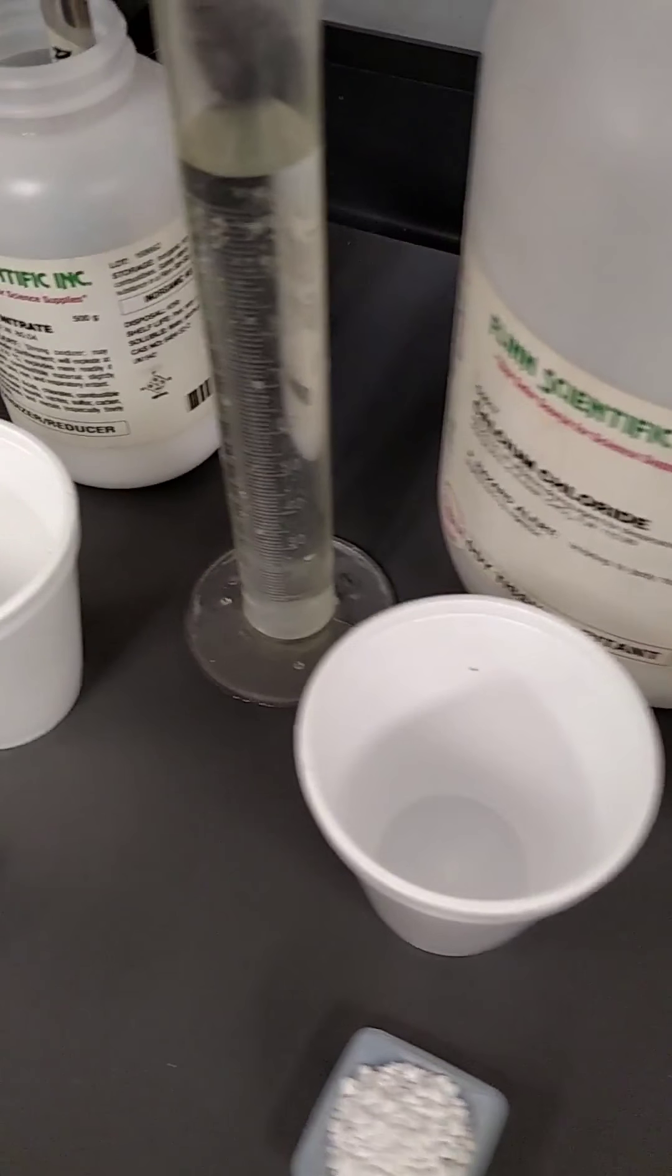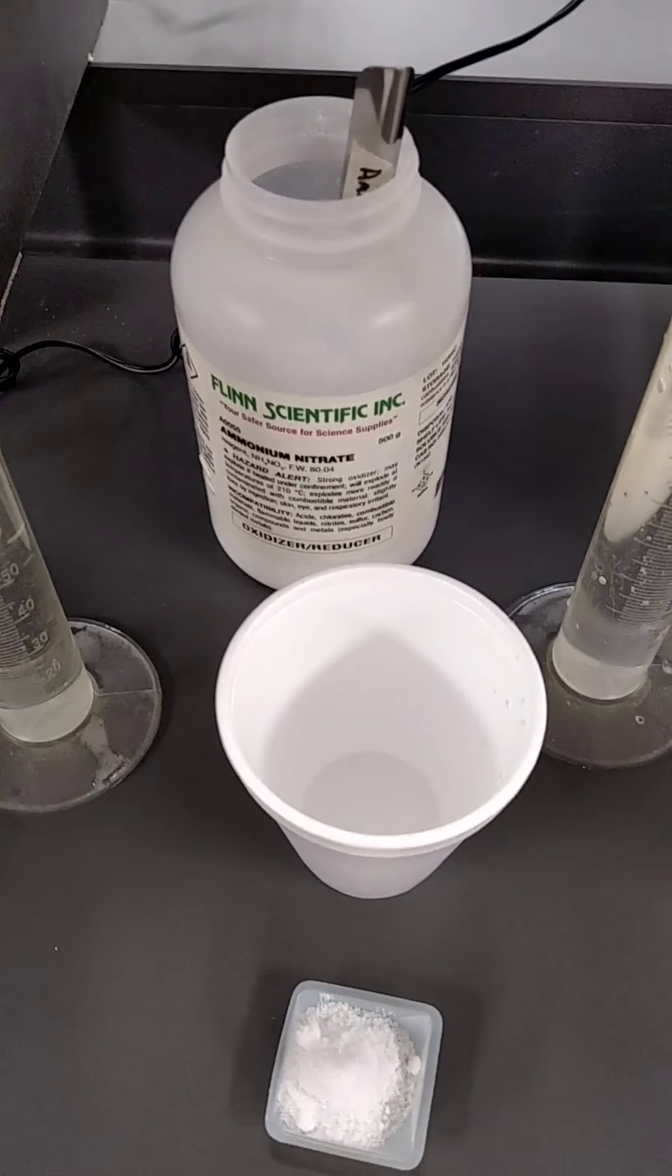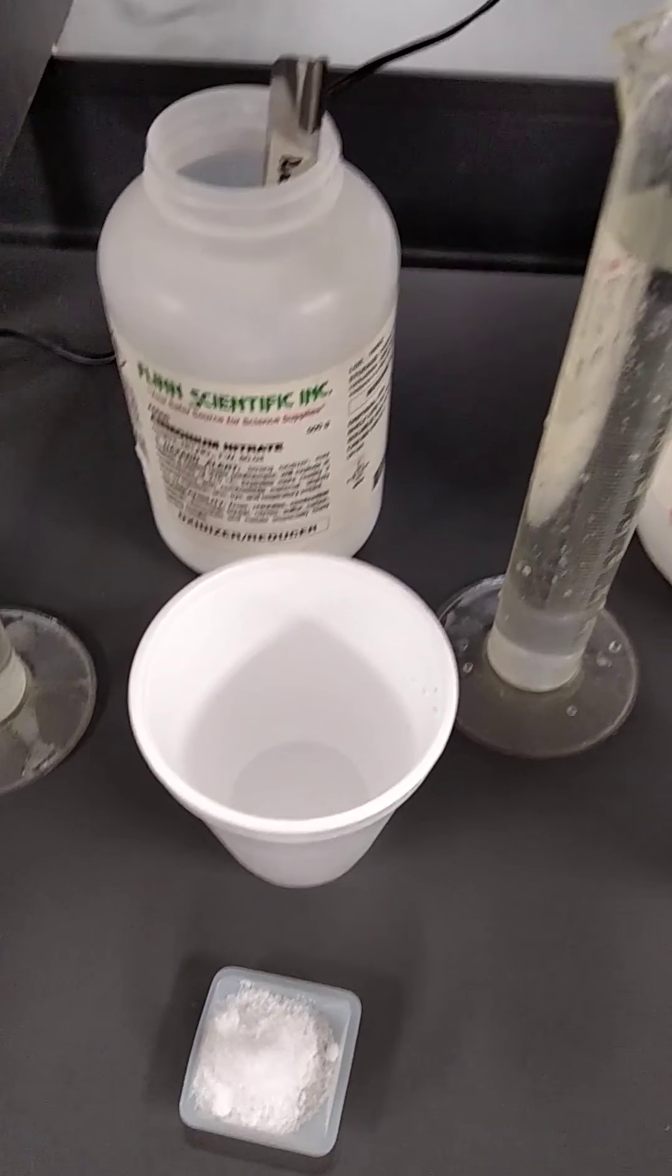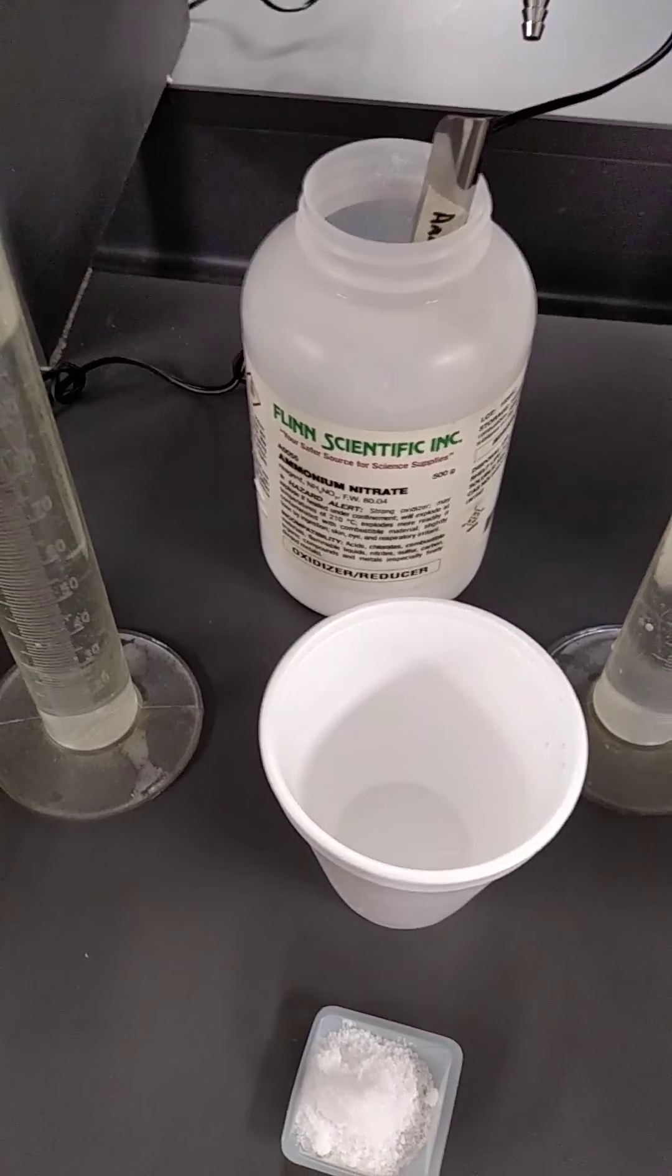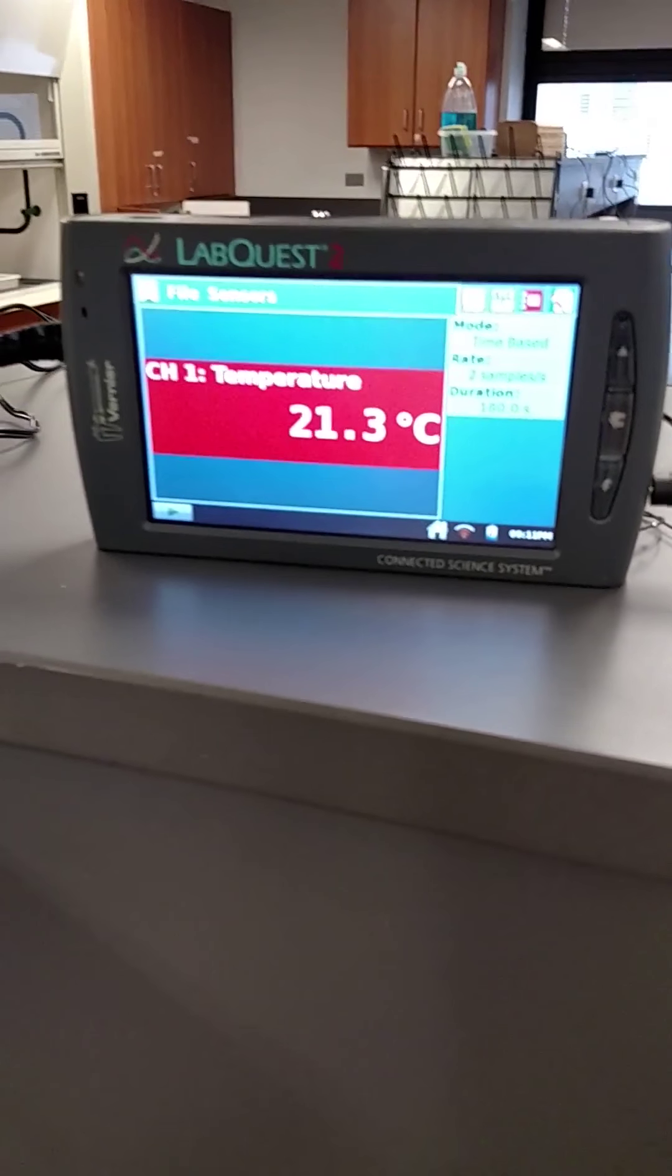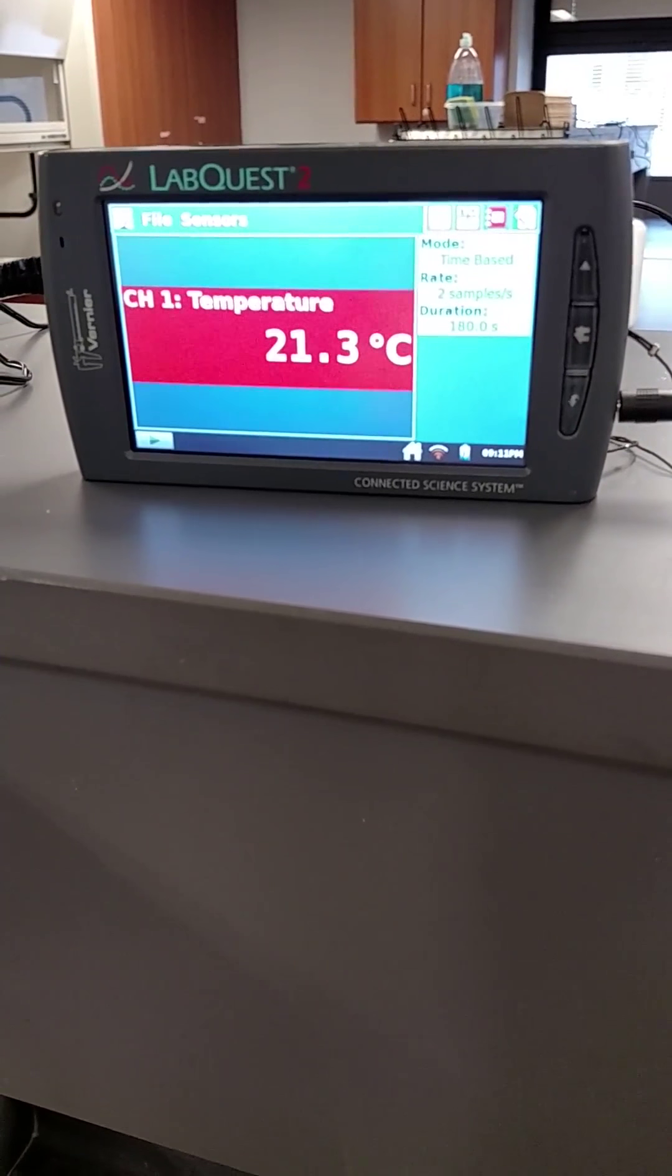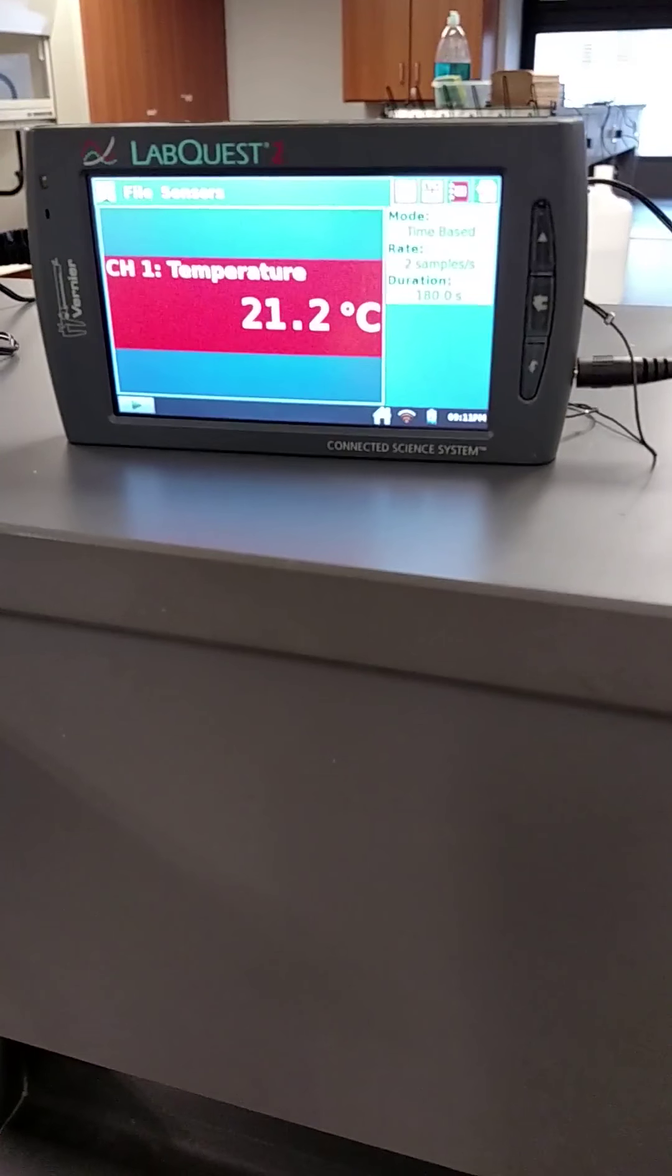So what's going to happen is we're going to add the five grams into each cup, and then 100 milliliters of the water, stir it around, and then watch the initial temperature and then the final temperature with something called a LabQuest. So this is the basic procedure, and now we'll start with each chemical.